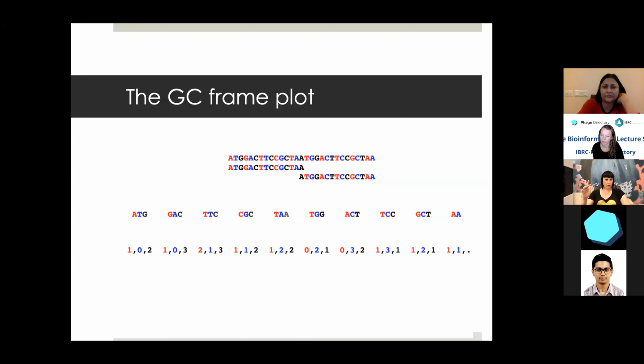I think the lab that does the mycophage stuff, the SEA phages, have the same kind of protocol where, rather than Artemis, they use DNA Master to get a GenBank, and then they go back in and do the manual curation to make sure the DNA Master output is correct. Both of our labs came to the same conclusion: you automate it, and then there's always a step of manually curating things.